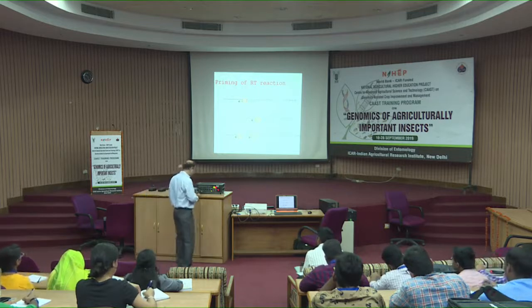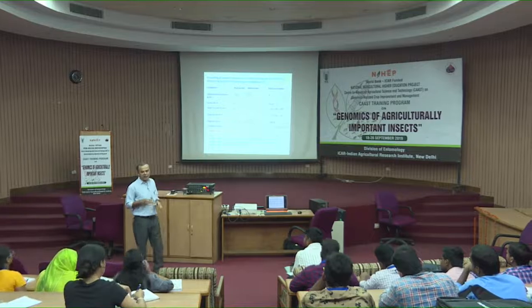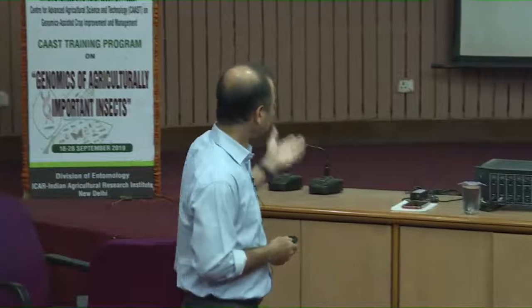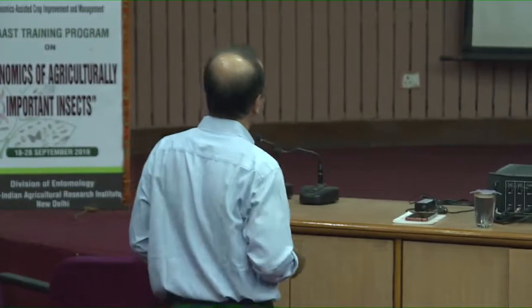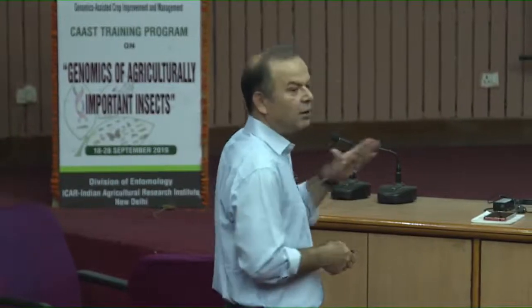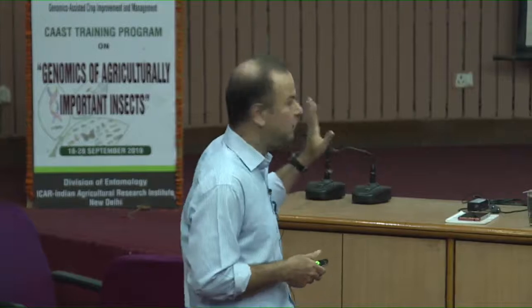But in doing RT-PCR, once you do the cDNA synthesis, your next step is PCR. So, RT plus PCR. RT you have done, now you have to do PCR, and I am sure you might have already performed PCR reactions in laboratories, right? They have done. So, you know what are the various components that are needed in performing a PCR. The only difference is here your template is the cDNA that you have prepared in the RT step. That is the only difference, otherwise it is as good as PCR.